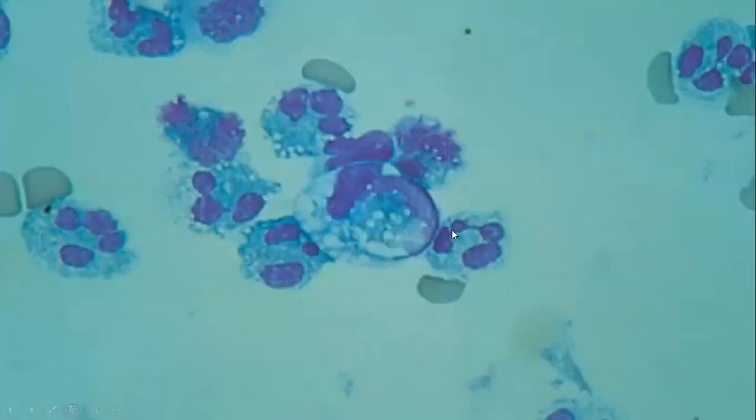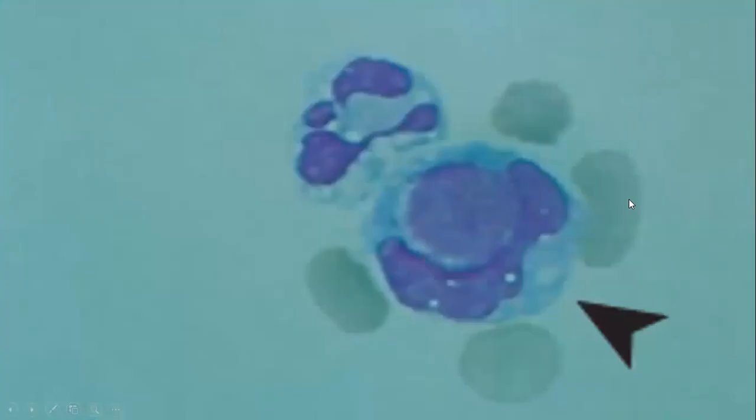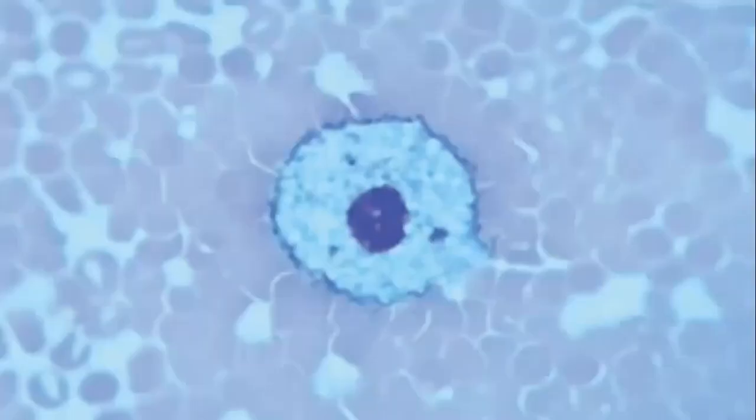This is a Reiter cell, a macrophage with ingested neutrophils. This is a TART cell, a macrophage with a nuclear component ingested. And this is a lipid-laden macrophage, Wright-stained.